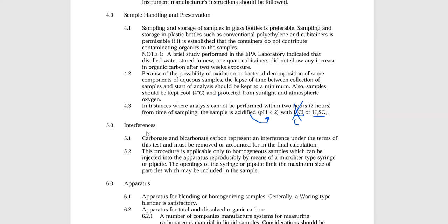Absolutely not. It's very easy. Anybody can be trained to do it in a couple of minutes. The problem is the money. So I don't want to keep forking out cash in order to keep switching out scrubbers, because we are adding HCl, which includes a halogen, which is a thing that cannot reach the detector, which is something that's got to go through the scrubber in our machine. So absolutely, if I get the choice, that's what I'm going to do.